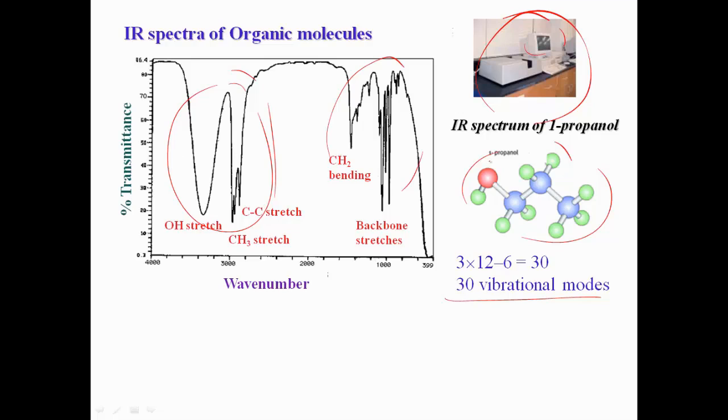So you've got an OH group here in the alcohol, and you can see it's a very broad band, and that's characteristic again of when you have this in liquid state. You have the propanol molecule, a little hydrogen bond with another propanol molecule, so that will affect the broadness, if you like, of the band. So that's another thing you have to consider when you're looking at something like a liquid state spectrum.